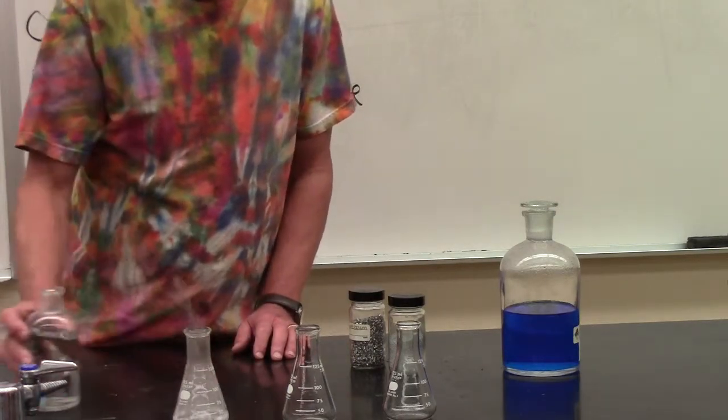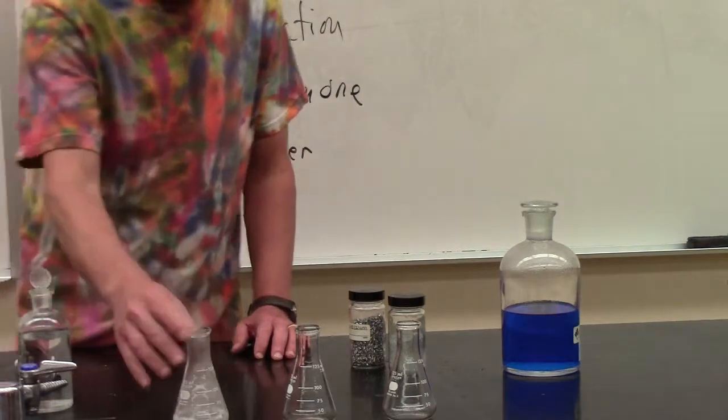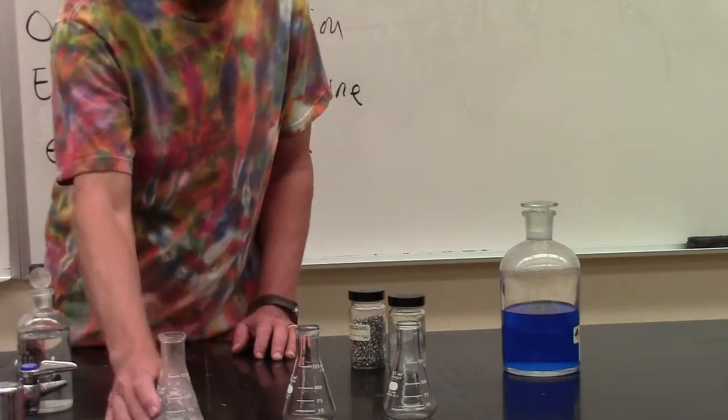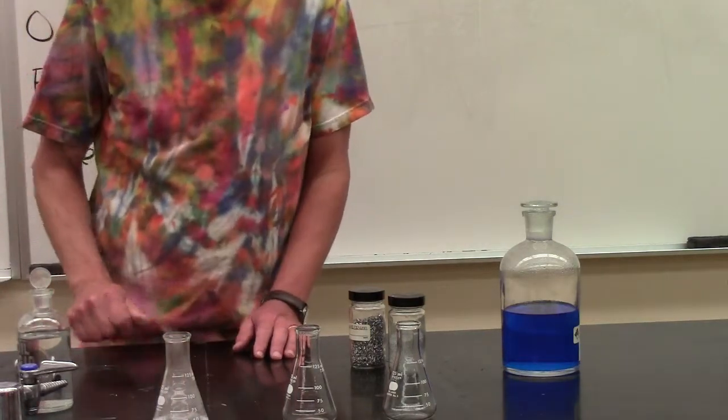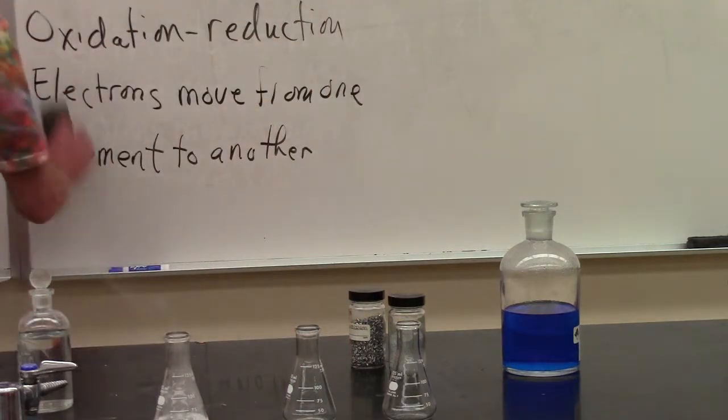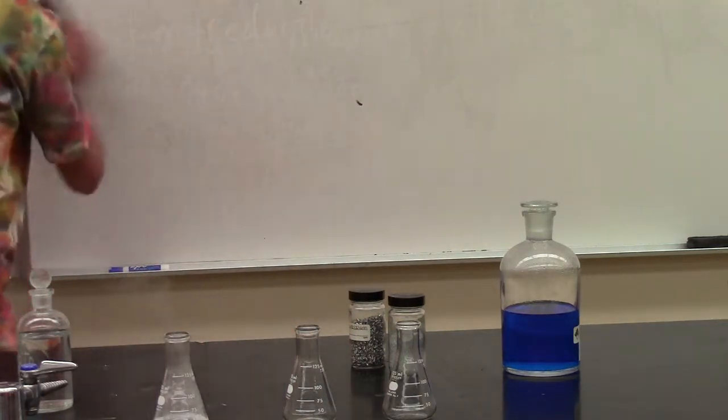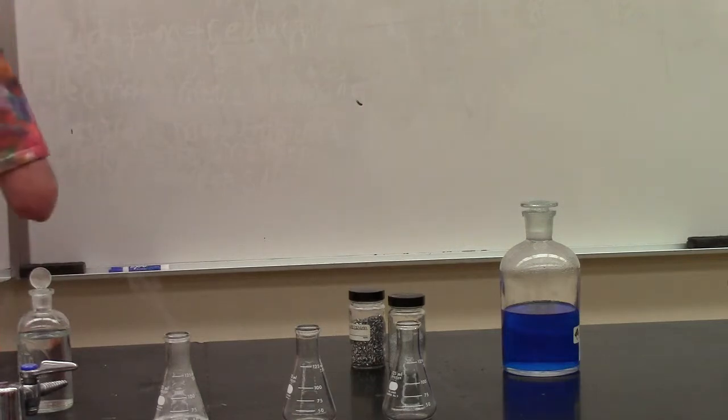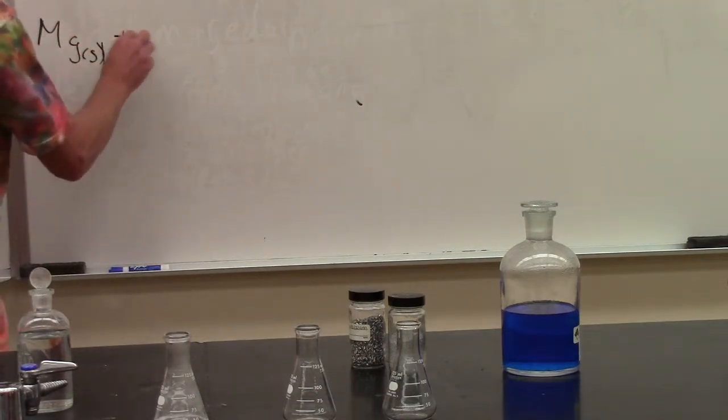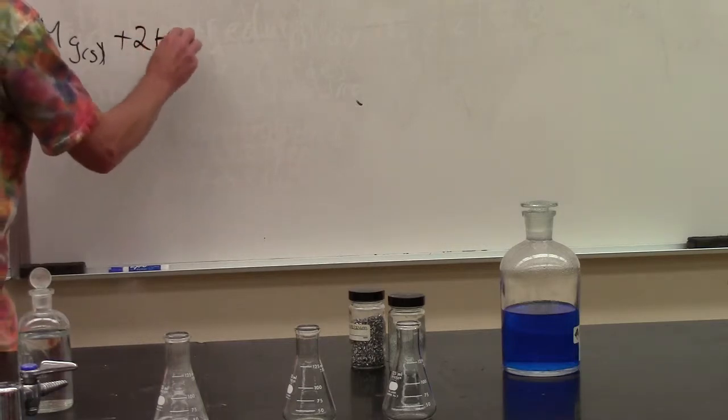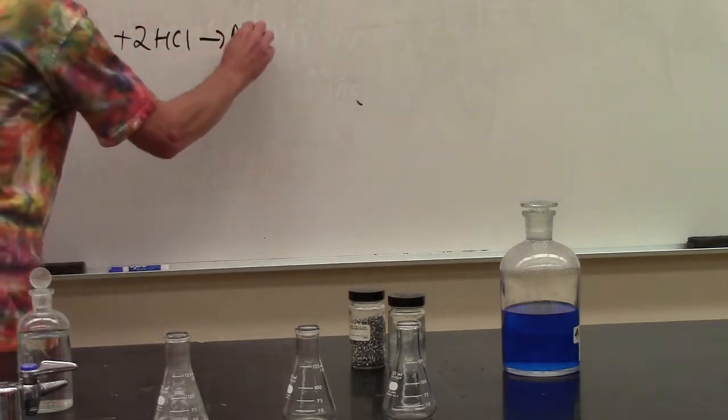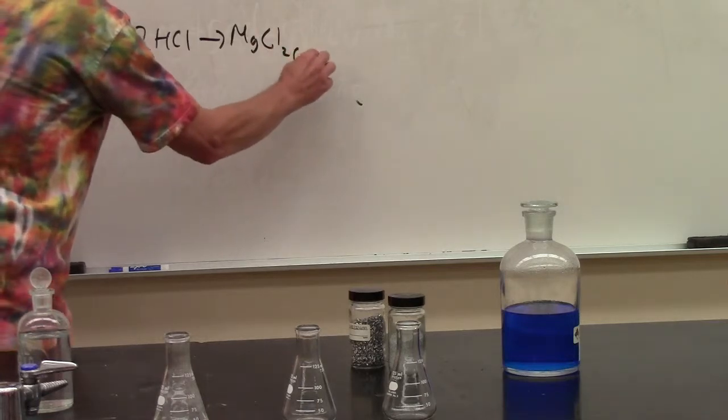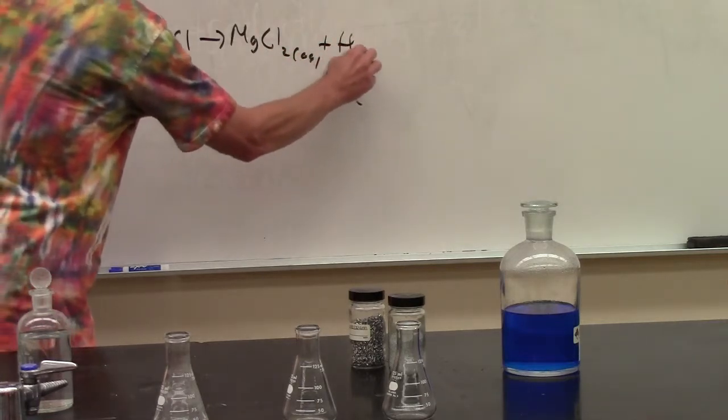You're going to see fizzing, bubbles, steam. It's getting very hot. We definitely have a reaction going on. So what's the reaction? The reaction is magnesium solid is giving its electrons to the HCl to make magnesium ion and hydrogen gas.